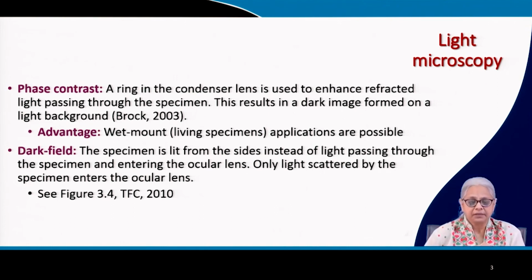And the biggest thing that is pointed out here is that the outer covering, or pellicle, of the cell is clearly visible, in contrast to bright field, because in bright field you have a light pellicle against a light background, so it's not very clear. In this case you have a dark background and a light colored pellicle.